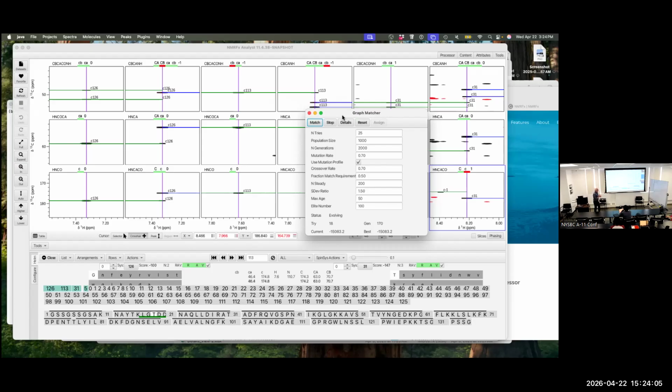We've decided to combine both these ideas. We use this bipartite matching, and we generate thousands of possibilities. Each time we randomly change the weight between each value, so the next time we repeat that algorithm, we get a slightly different match. That then becomes the population that goes into this genetic algorithm that mutates. So the nice thing is that all the initial things aren't random matches, they're all things that are conceivable. And so that's what it's doing over here.